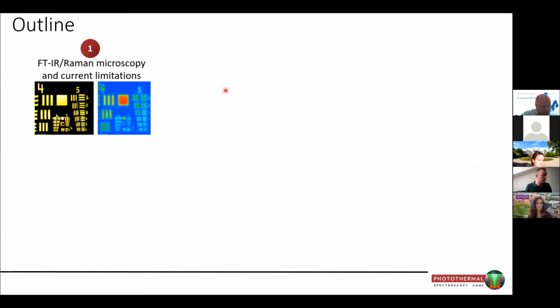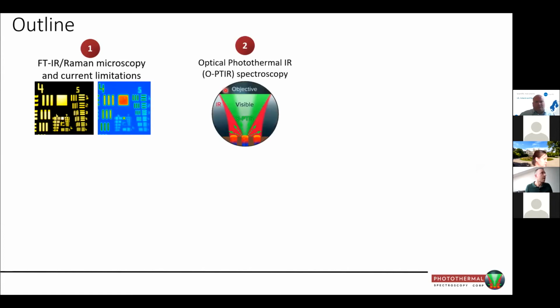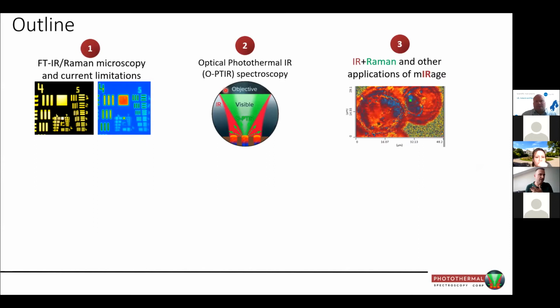So today I'll take you through an outline of the limitations of current FTIR or current infrared. I'll take you through how O-PTIR works and all that it provides, and then I'll give you a brief snapshot of applications, and then we'll pass over to our main speakers today.